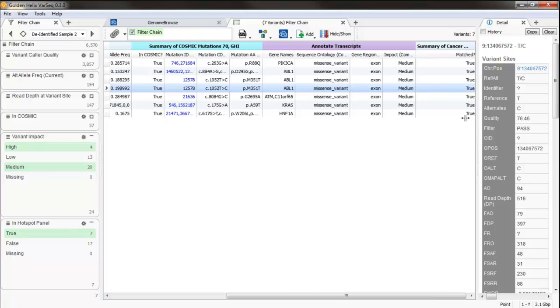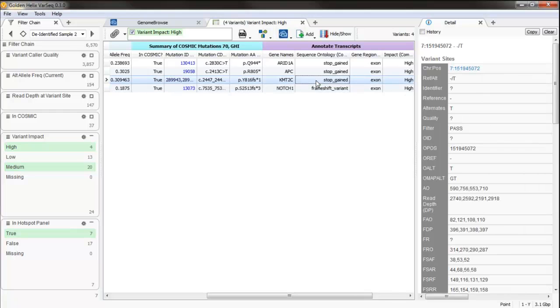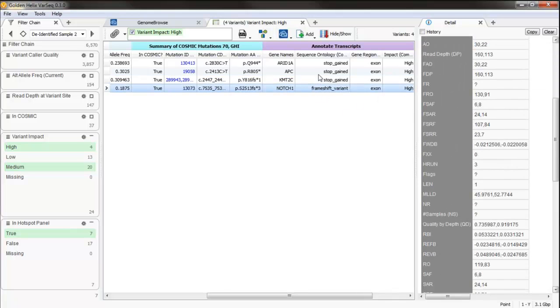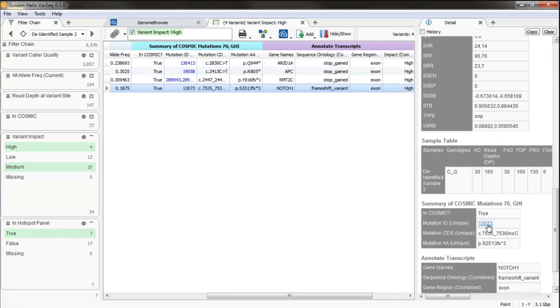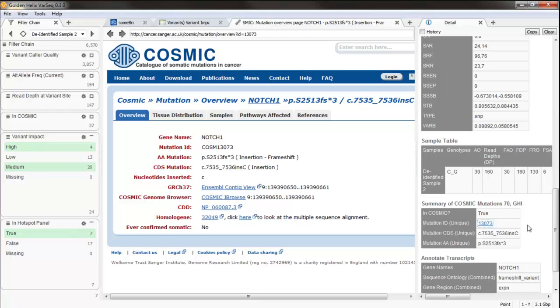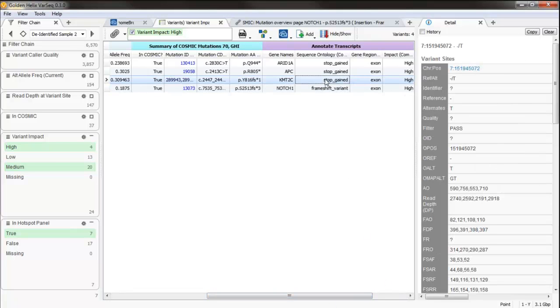I also have the full richness, and actually I want to look at maybe these high impact variants, these are pretty interesting, of this detailed view where I can actually start to see what's going on at this row and pull in all the annotations available. This includes those hyperlinks, so again I can bring in hyperlinks to bring in pages. I'm going to go ahead and dock this to my window so I can maybe go back and forth and see those hyperlinks as well for other samples or for other variants.